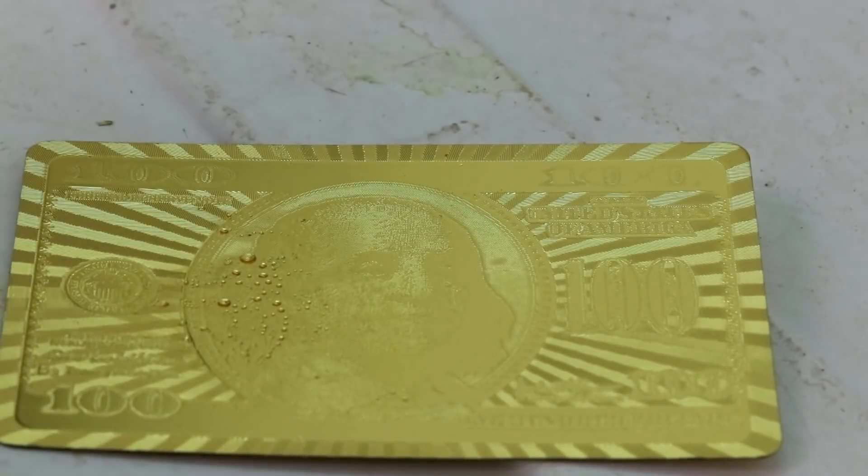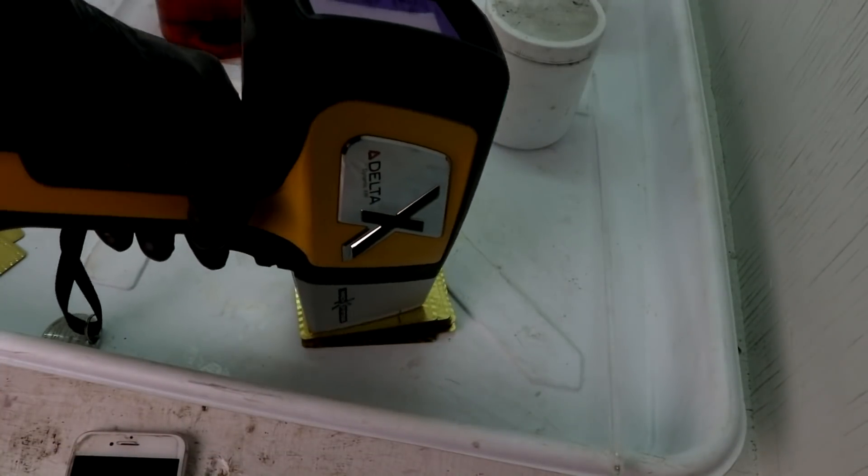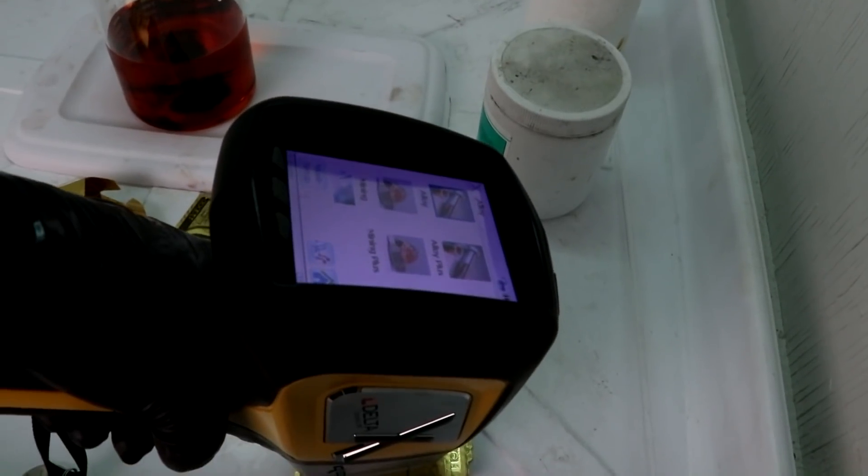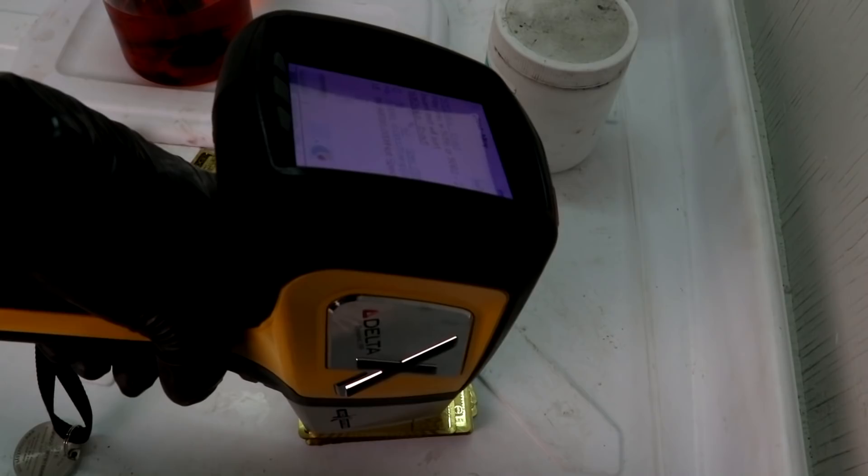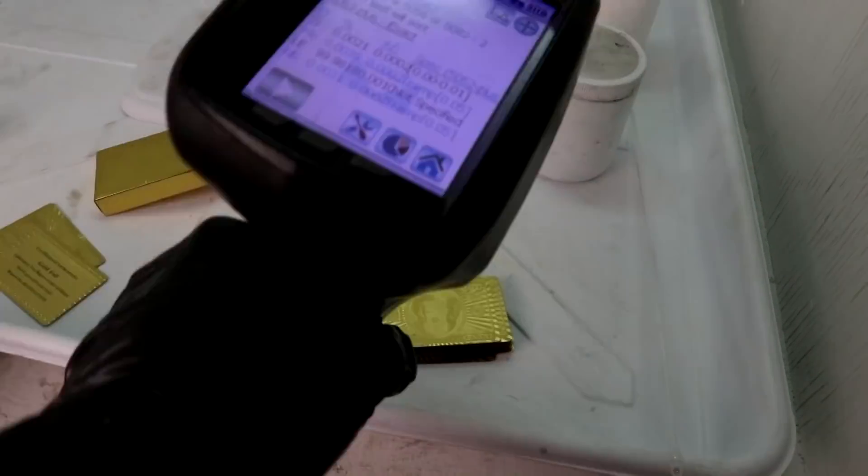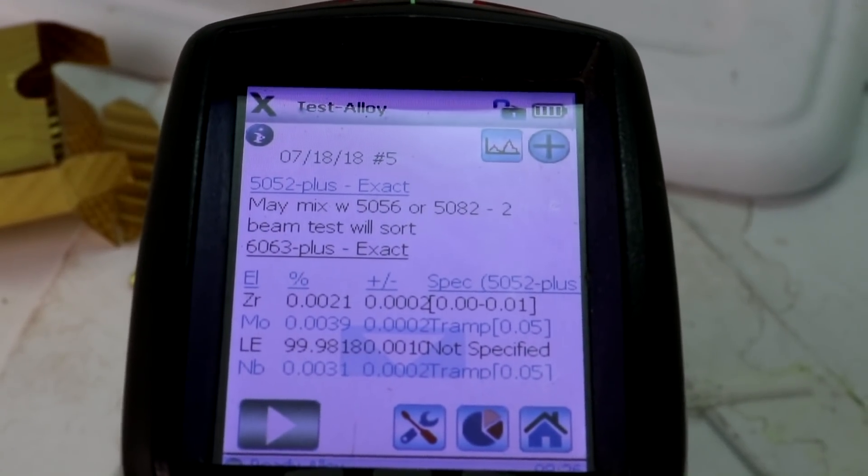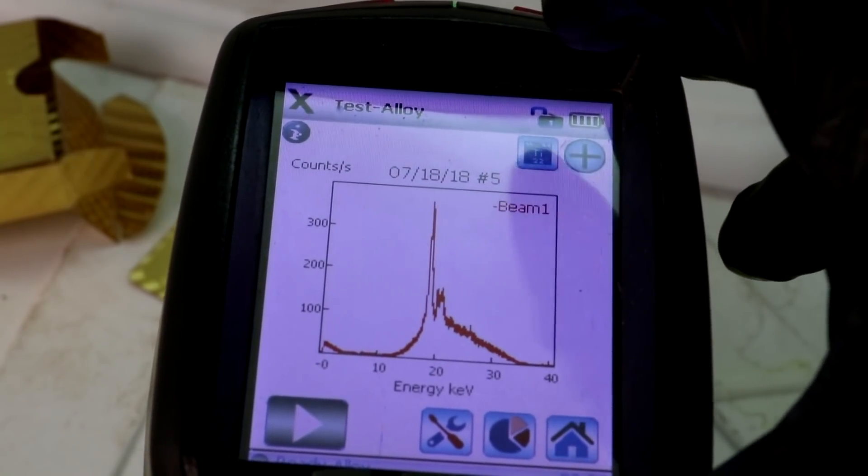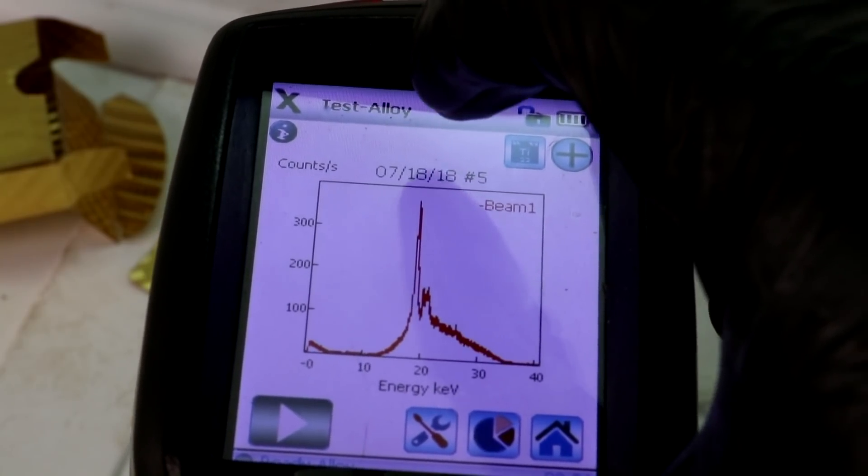Interesting. Yeah, let's go grab the x-ray. Let's see if this is even gold. Alright, let's just x-ray this stack here. See what we lined up with. Okay. Alright, so it's just giving me light elements there. Let's have a look at the graph. Well, I can tell you right now there's no gold in that. There should be a spike right over here at 9.7.